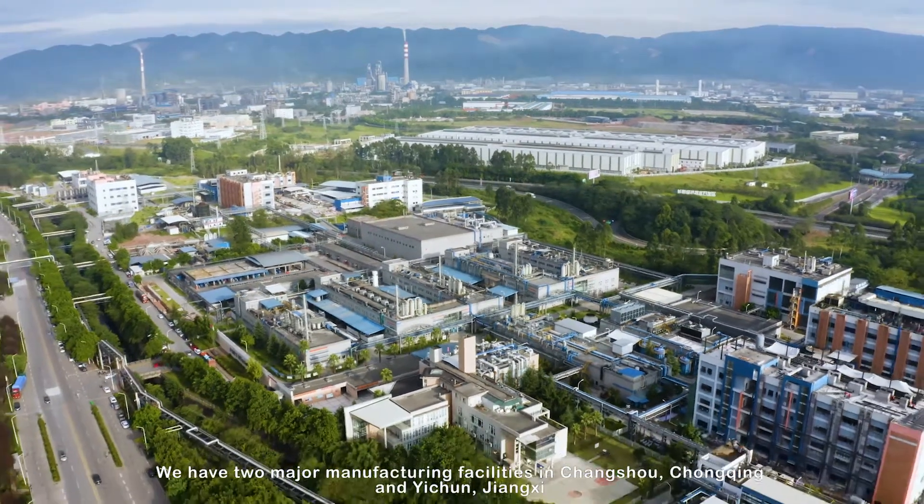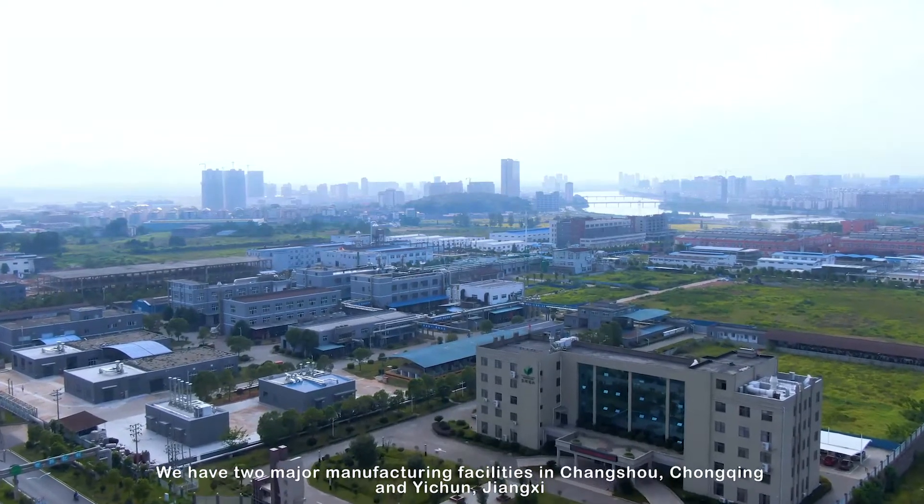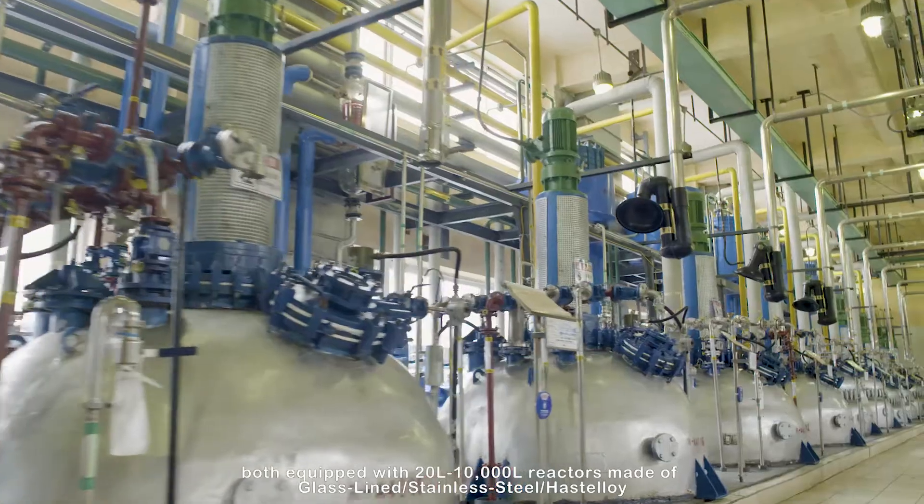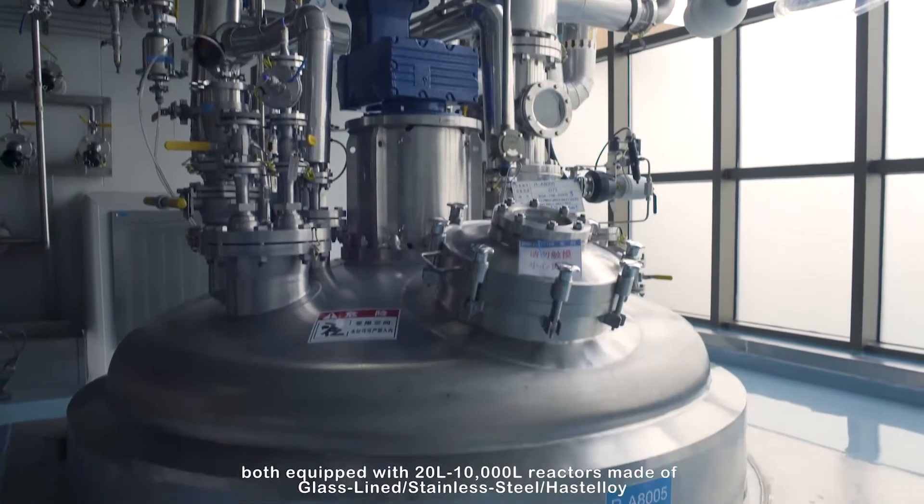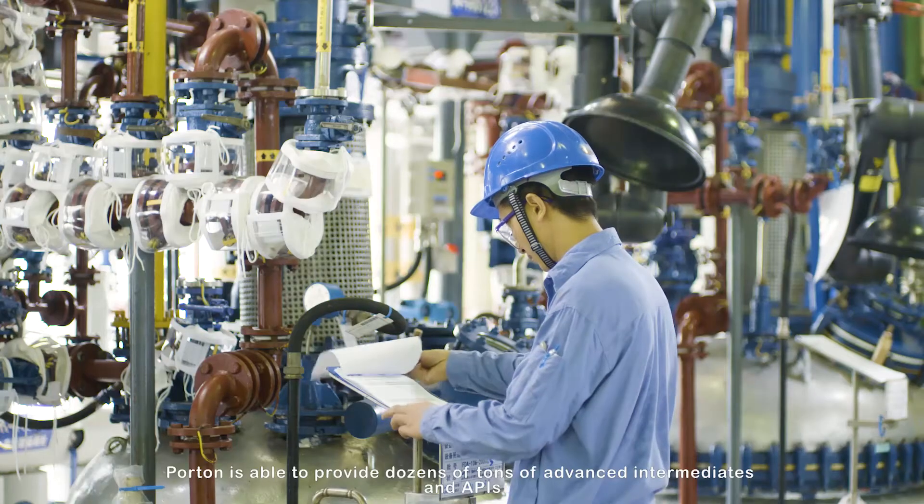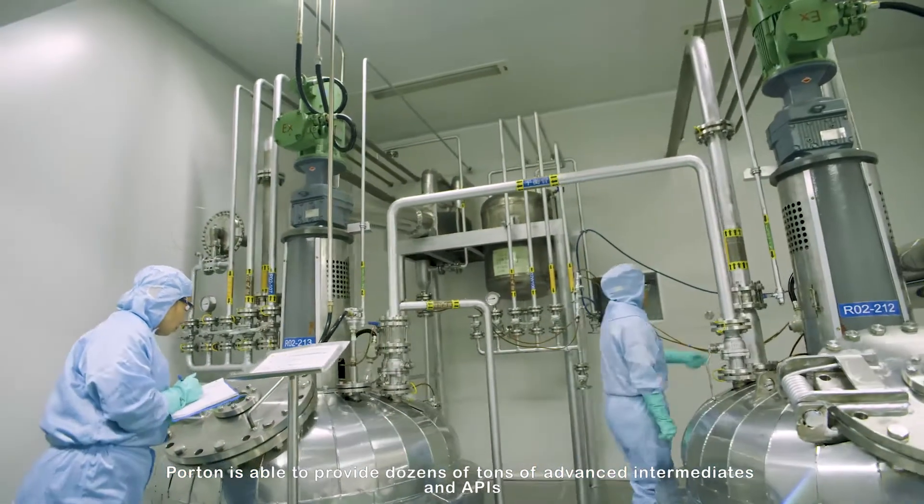We have two major manufacturing facilities in Changshou, Chongqing, and Yichun Jiangxi, both equipped with 20-liter to 10-thousand liter reactors made of glass-lined, stainless steel, hastelloy. With a total capacity of more than 1,200 cubic meter, Porton is able to provide dozens of tons of advanced intermediates and APIs.